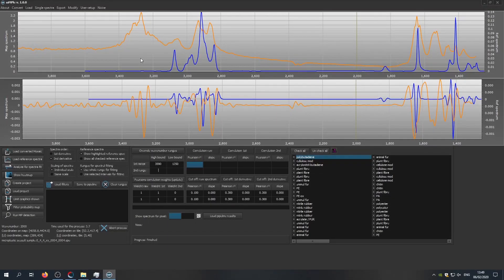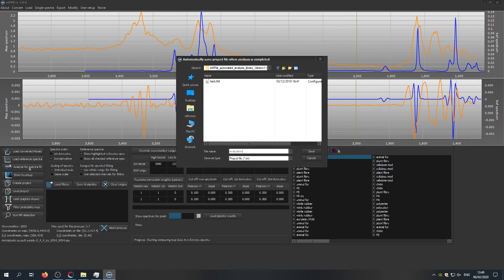What we see here is the Simple software. We already loaded our imaging data, we loaded a reference library that is available from a publication of the Alfred Wegener Institute, free of charge, and all we need to do is click Analyze for SpectraFit.